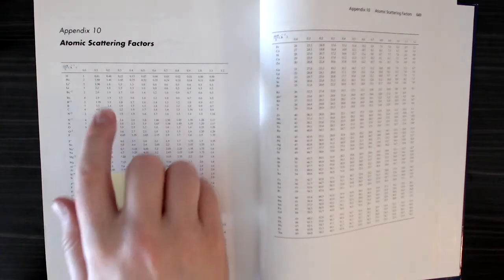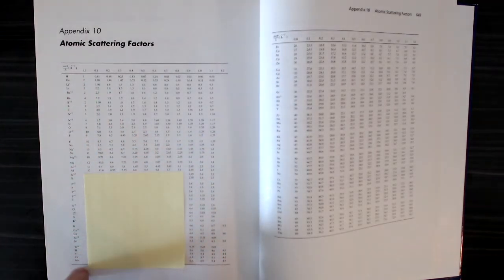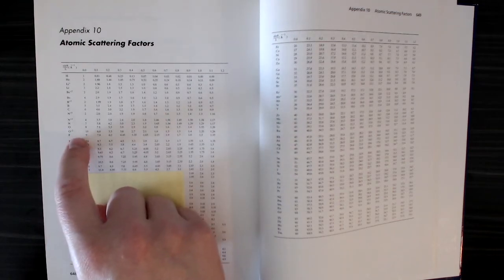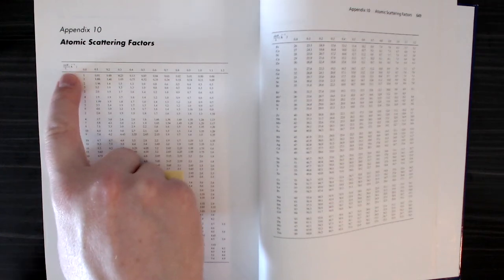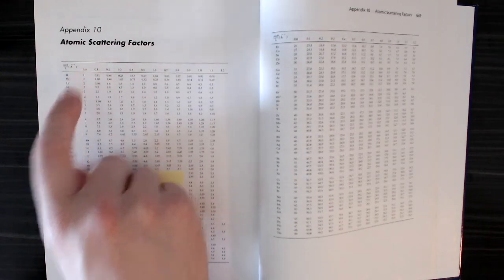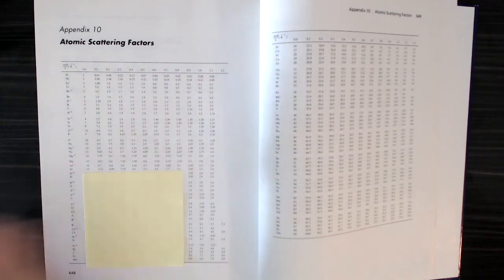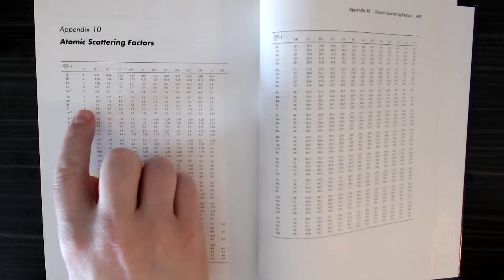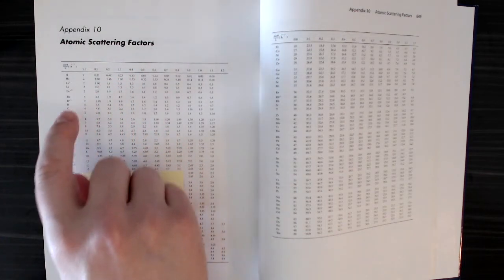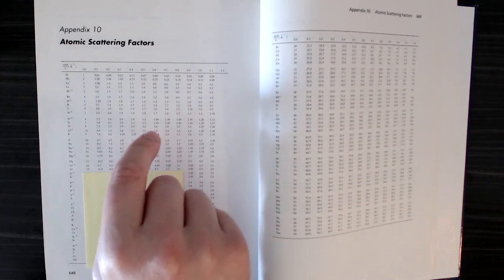So we can find this, and what you see here is that along here there's a number of different atoms, and then you can also find select ions. And up here is the sine theta over lambda term, which is common throughout these calculations. So you'll want to calculate that for your peak. And then basically this gives a tabulated value for the atomic scattering factor of a given atom or ion at that given angle. So it's angle dependent as well.